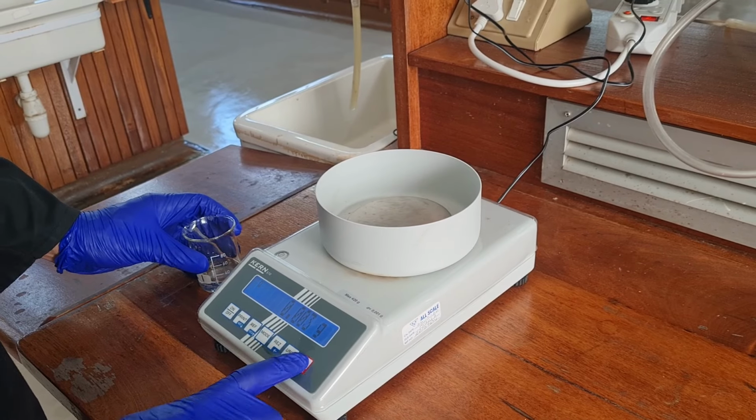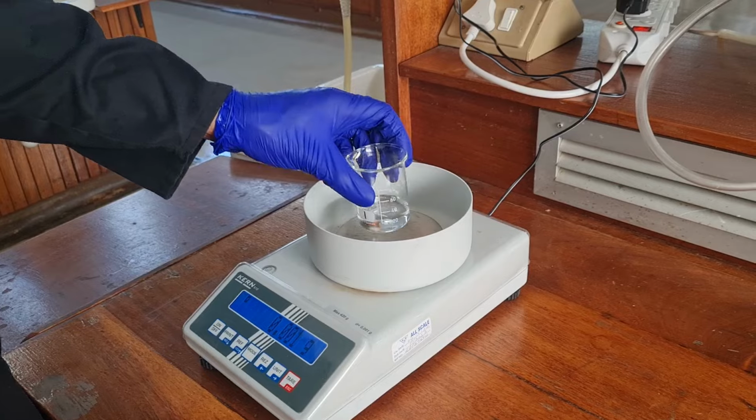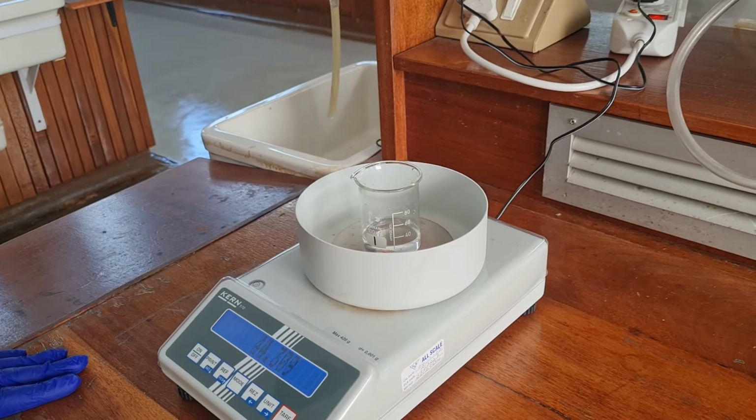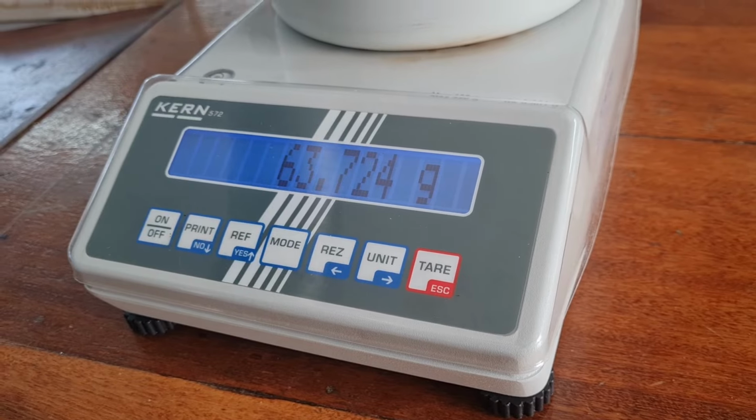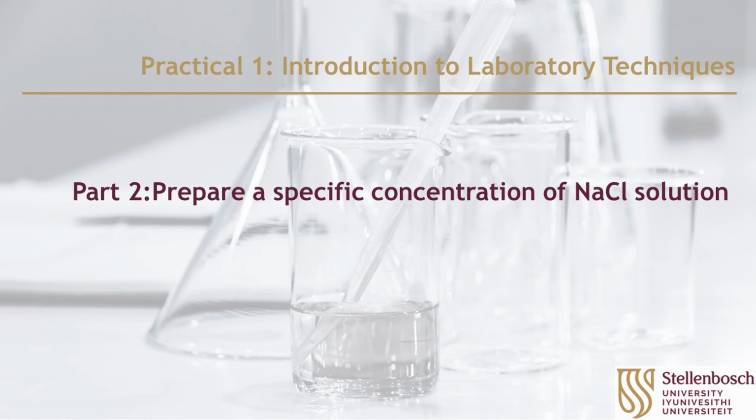Weigh the beakers and make a note of the masses in your table as measurement 1, 2 and 3 respectively. Pour out the unknown solution into the supplied waste bottle, rinse it with water and dry the beakers using paper towel. In part 2, you will prepare a specific sodium chloride concentration.